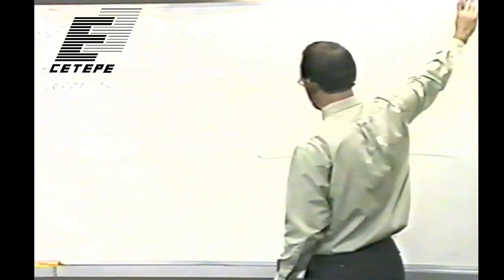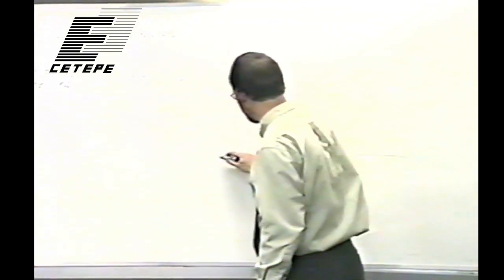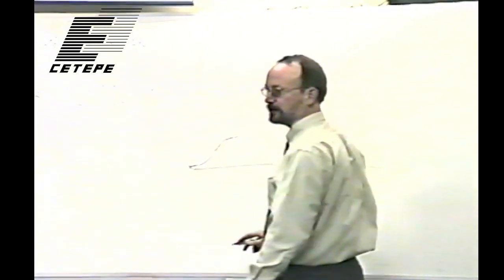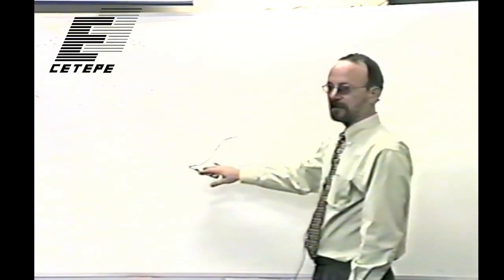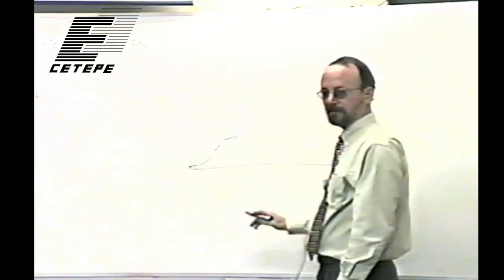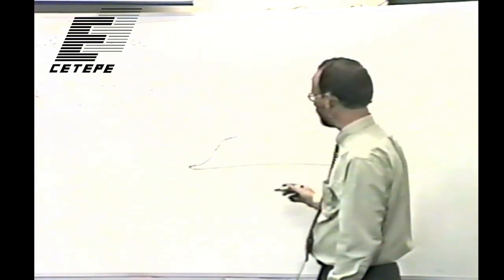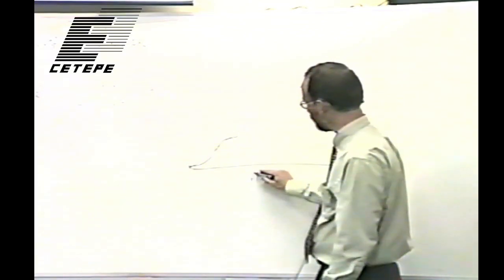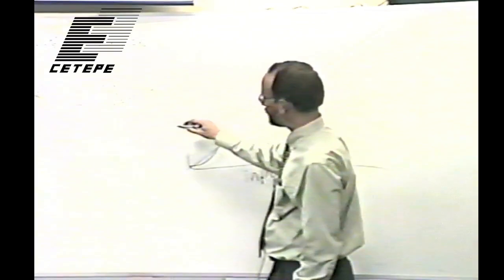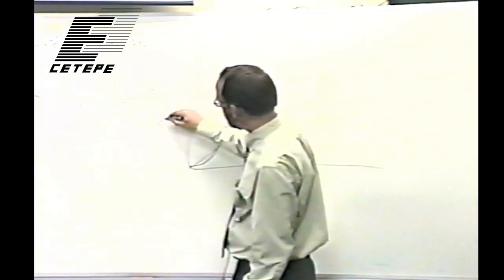So if you drew the dynamic range, CCDs would be like this, and film would be like this. I'm trying to show both a nonlinearity and a vastly inferior, much worse dynamic range. Where this would be the input exposure, and this is the output signal.